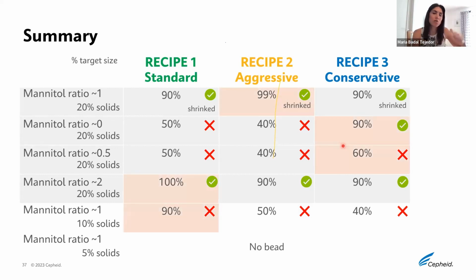And then, of course, in each of the cases, there is an optimal cycle that works best. And of course, we want to be able to run as aggressive cycles as possible. So for that case, it's good to have a component that crystallizes, like Mannitol, in the formulation, but still it's possible to dry without Mannitol. But in that case, we need to be more careful about the rate at which the energy is given to the system.